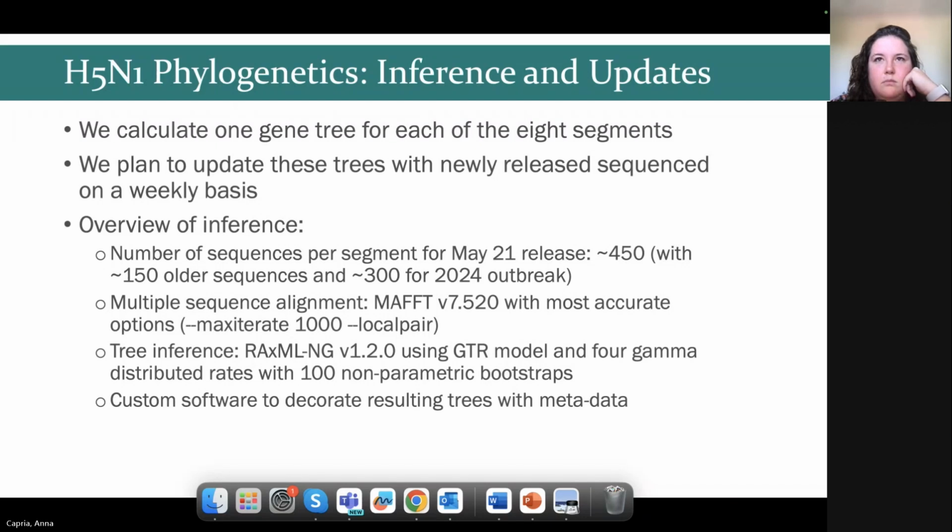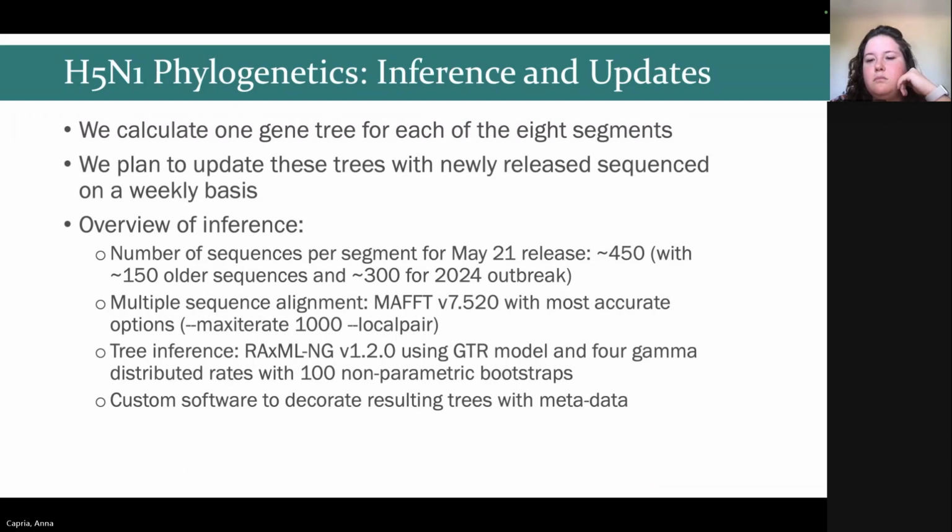As I said, for this week, May 21st, we have about 450 sequences, where about 150 are older and 300 are from this year's outbreak. And then we use the MAFFT program to calculate the multiple sequence alignment using the most accurate options, for people who are familiar with this program.